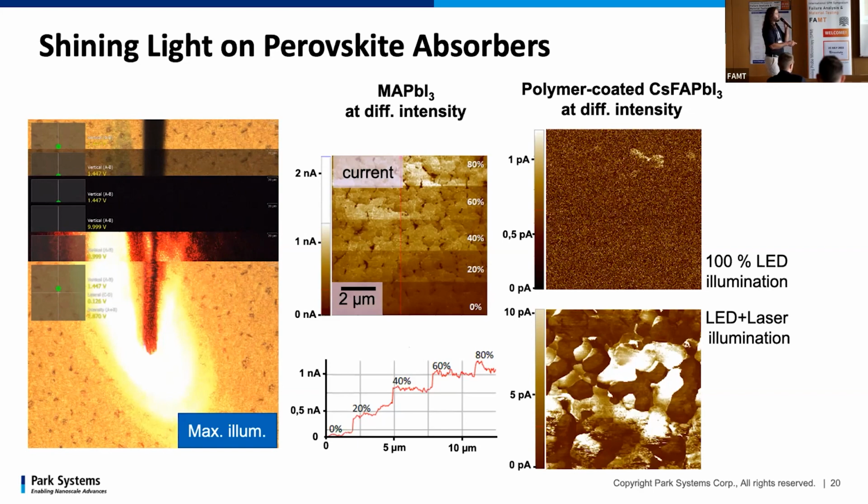These non-conductive domains you see here are quite frequent in perovskite solar cells. Up to now, it's still debated where these domains originate from, at least to the best of my knowledge. In my point of view, this is mostly a surface phenomenon. Whether the film is 300 nanometers or 600 nanometers thick, we see these domains in both cases, and we see the number and size of the domains increasing when exposed to humidity.